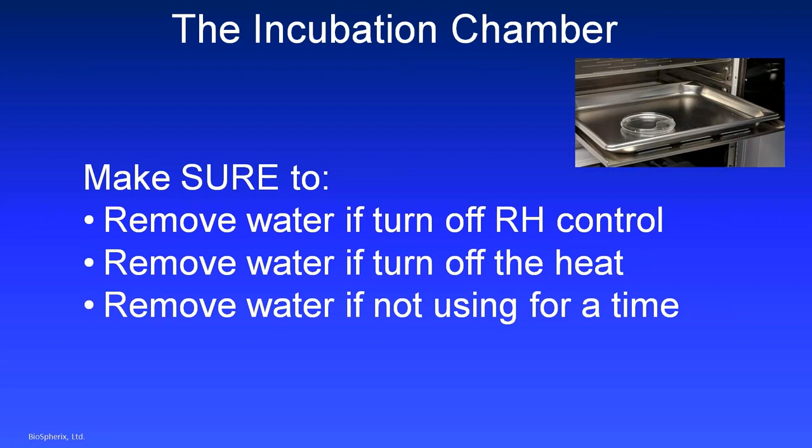And then the next day they come in and the sensor is saturated and they've gone through all their gases and they've got a problem. So make sure to remove the water if you're taking your cells out for any length of time, if you're turning off the heat, or if you might turn off the RH control. Don't forget about that dish of water in there and leave it in there. Just take it out.